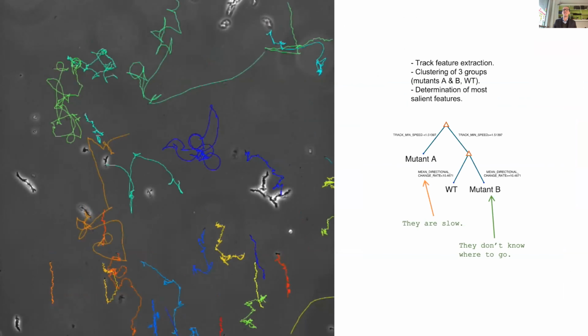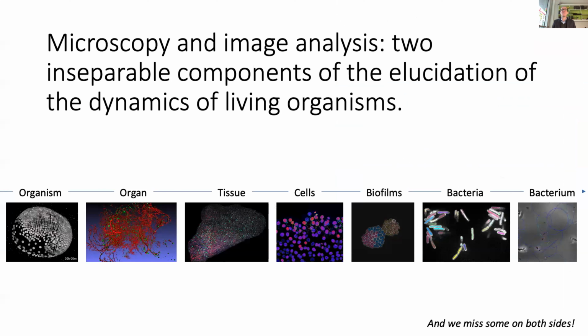It's impossible to cover that. So this is part of the things we've seen. For the sake of time, I haven't been able to tell you about organ level or tissue level analysis, also of urinary tract infections, that's also a fun topic, and so on. And there's still much more of what you can harness with microscopy and bioimage analysis.